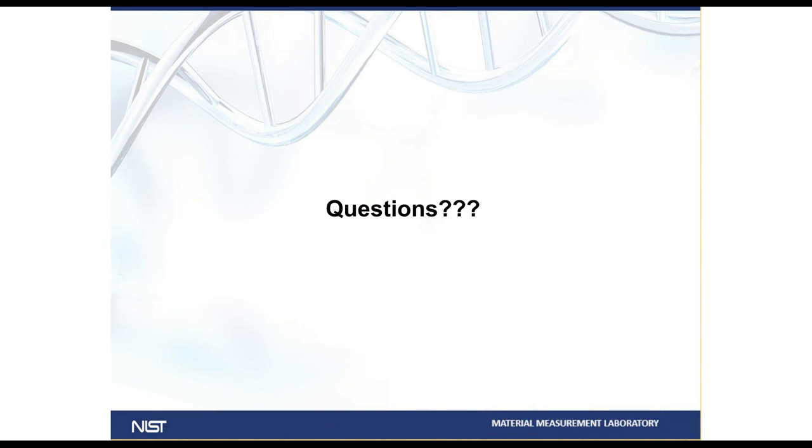Okay, thank you, Paul. And our next question here. Can I use Accucheck ERF particles as intensity reference for a spectral flow cytometer? I have a Cytek Aurora. Yes, the answer is yes, as long as the spectral range used to determine the fluorescence intensity is the same for the spectral flow cytometer and the calibration bead.